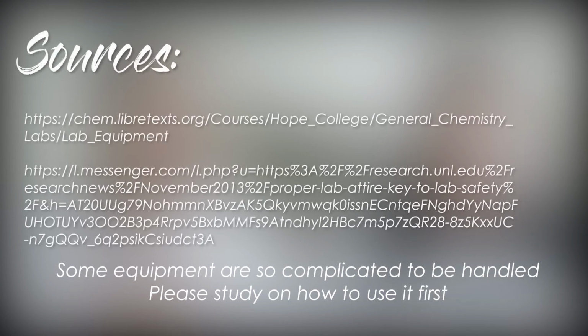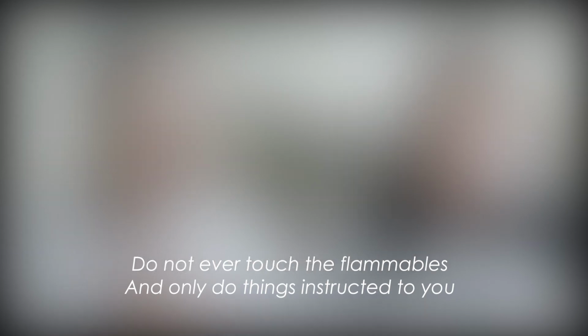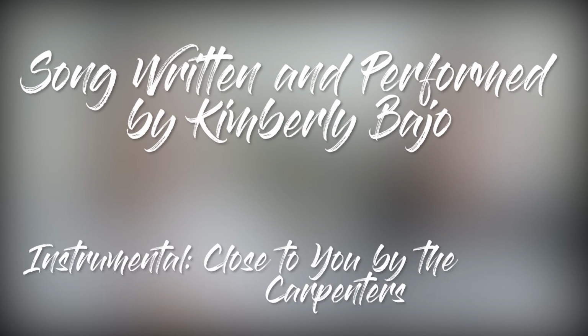Some equipment are so complicated to be handled. Please study on how to use it first. Do not ever touch the flammables and only do things instructed to you. That is why you should know the use of the tools and chemicals. Then clean them, put to safe place after use.